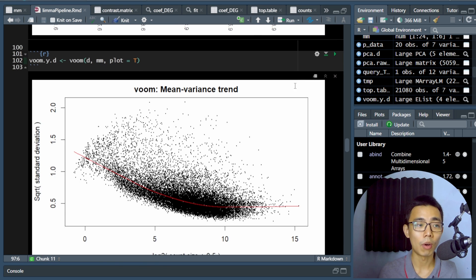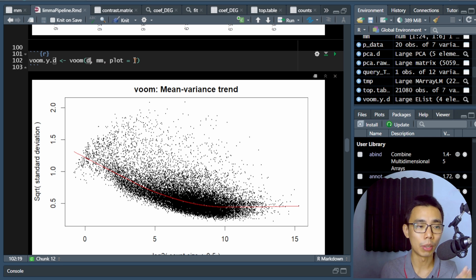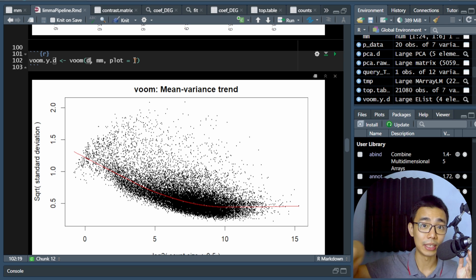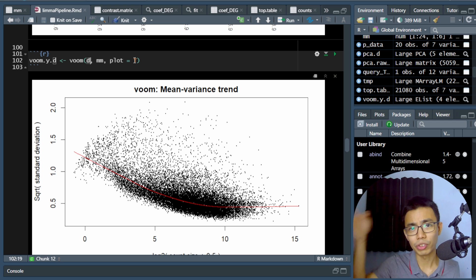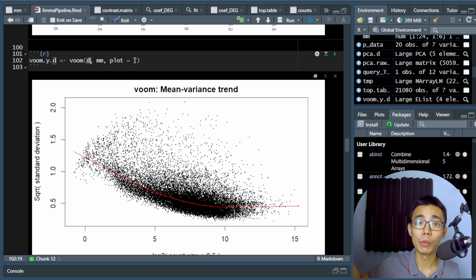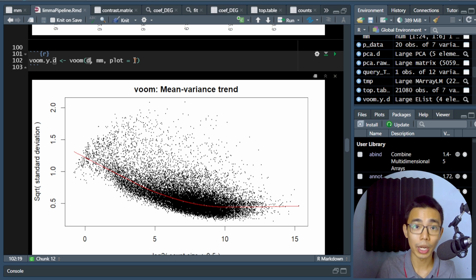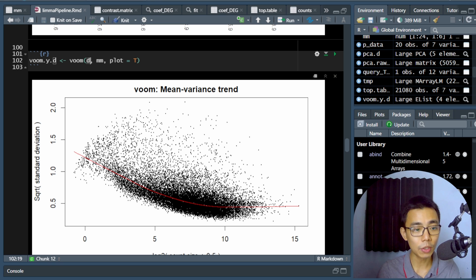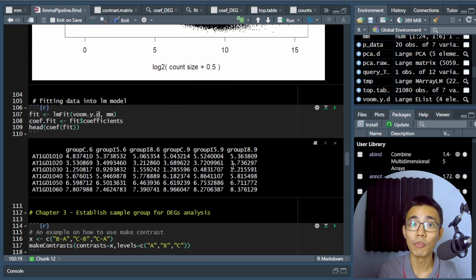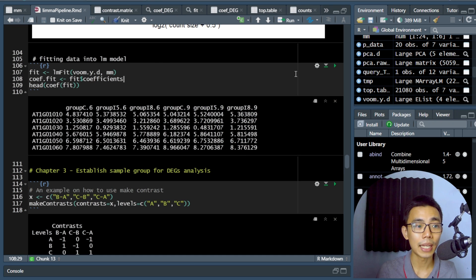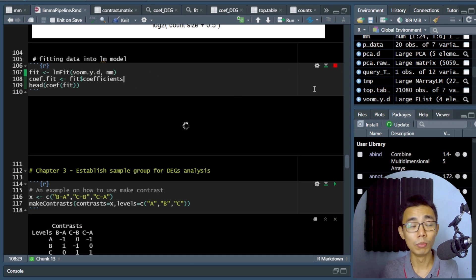Next, we apply the voom transformation to the filtered DGE object. You should expect to see something like a J-shaped pattern in the mean-variance trend plot. If you see a straight line, normal distribution, or some other unusual curve, check your sequencing data — whether your filtering was done correctly, and whether your count table was generated properly from tools like STAR or HISAT2. If it looks roughly J-shaped, you're safe to proceed.